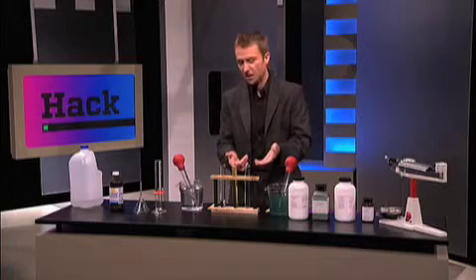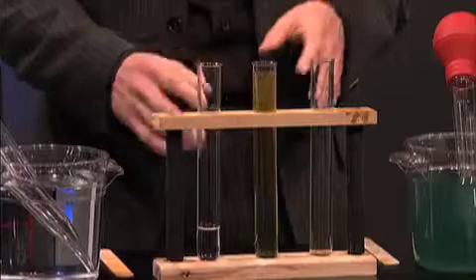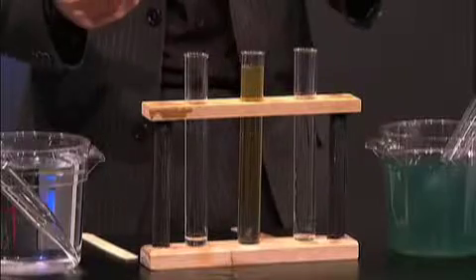Now, what you're going to be left with is sort of a urine sample looking thing. It doesn't glow for very long because the industrial strength glow sticks actually have chemicals in there that are secret, and they're also airtight, so the reaction is going to last longer. So I would say if you're a chemist on your way to a rave or you want to make a Tron battlesuit, this is probably not the solution for you.